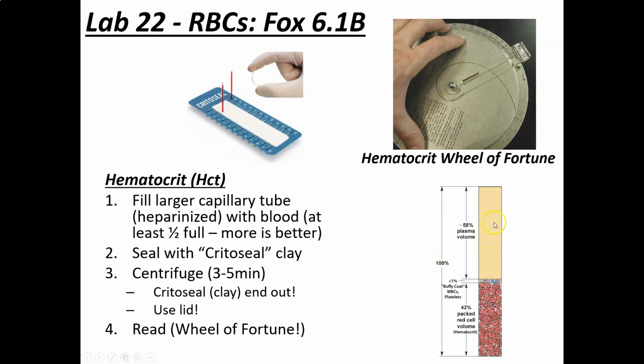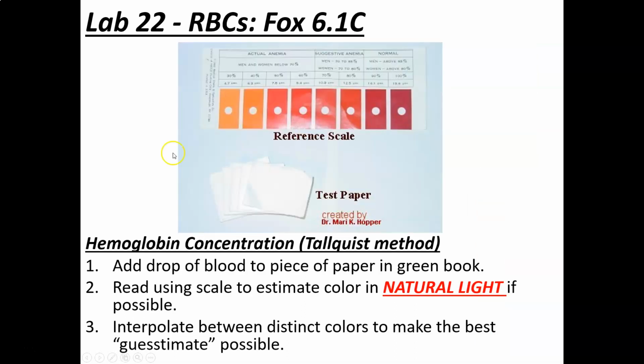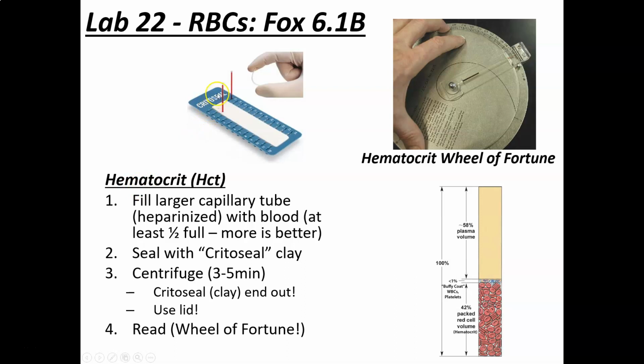And again, what happens is when we measure blood initially, this is called whole blood, sometimes called capillary blood, a little different. And the red blood cells and the plasma is all mixed together. If we take it and put it in a centrifuge and spin it very fast, then we separate the blood into two components that we can see, and a third component that is virtually invisible. For the two components we can see, the bottom layer is the red cells and the top layer is the plasma. And in between, it's very difficult to see it, but that is called the Buffy coat. And the Buffy coat is made up of white blood cells and platelets.